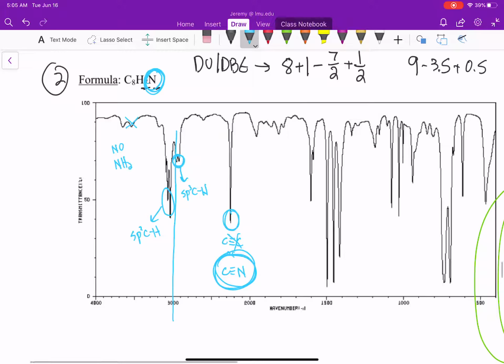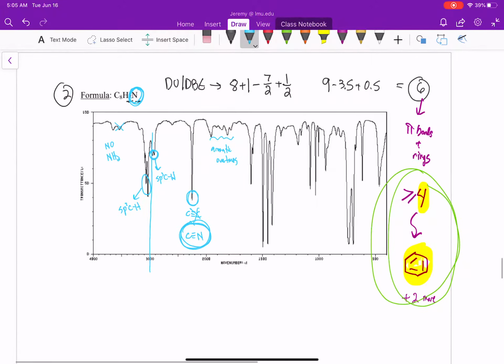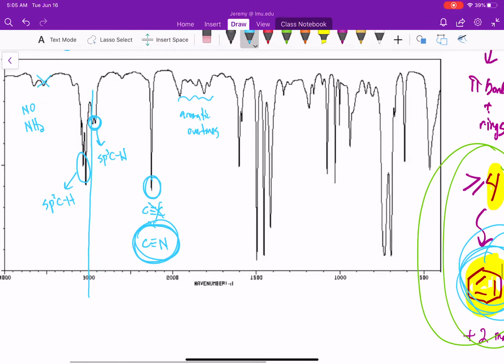I get to zone 4. I have 3 or 4 small peaks here. Those are my aromatic overtones. So we've now really confirmed that we have our benzene ring here. And just to finish that off, we have a couple of peaks at about 1600 and 1500. These are our carbon-carbon double bonds. And we can basically ignore everything below 1500 or so, all right?